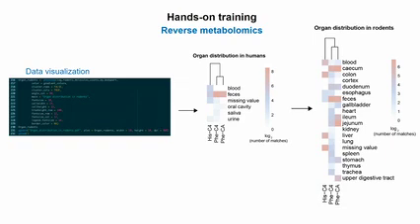So here you can already see that some of these molecules have different distribution patterns, and you get a lot more matches on rodents, right? Of course, because we have access to more body parts and biofluids than in human, and we have much more data on rodents than on human for different specific body parts, right? So for this, that makes sense.